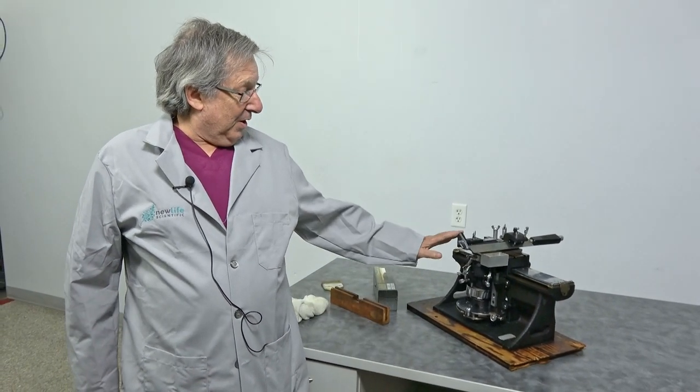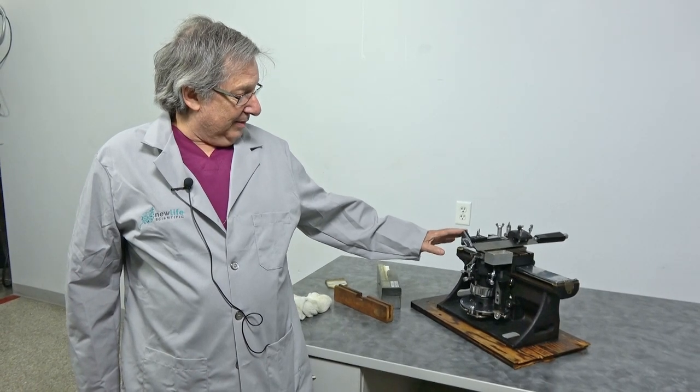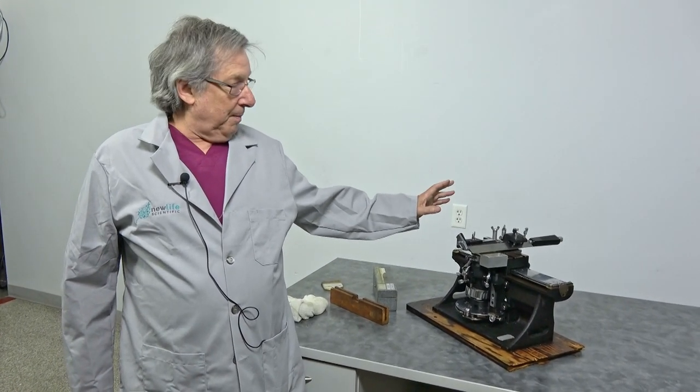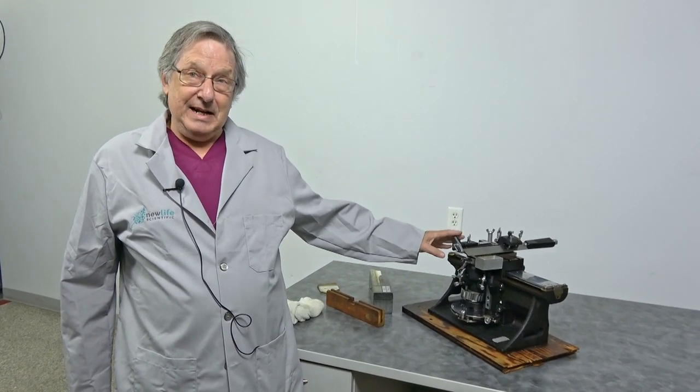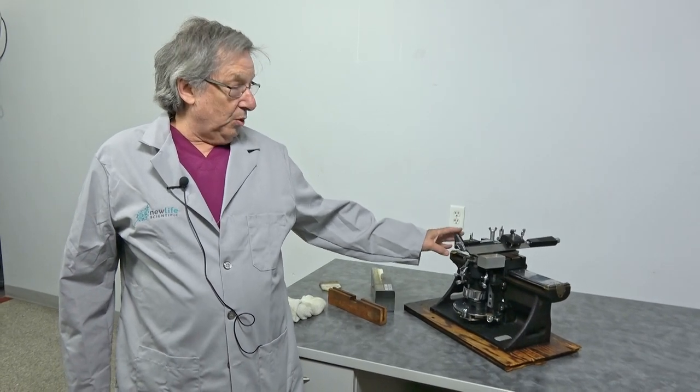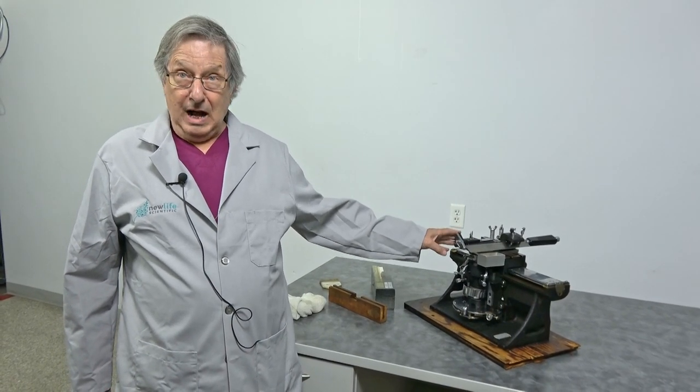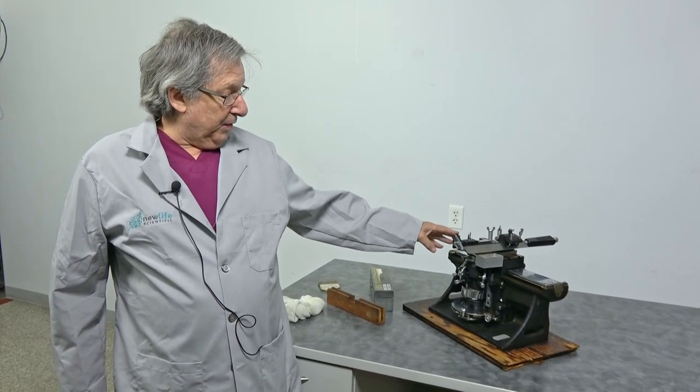Hello, welcome to New Life Scientific. I'm Steve. Today we wanted to show you a unique piece that we got in, a Spencer sliding microtome model 860, sold and marketed by American Optical out of Buffalo, New York.